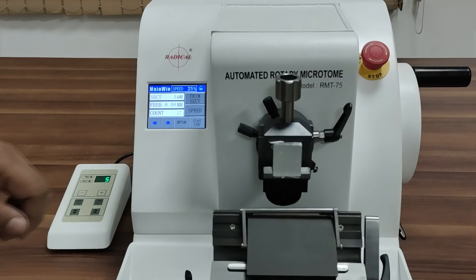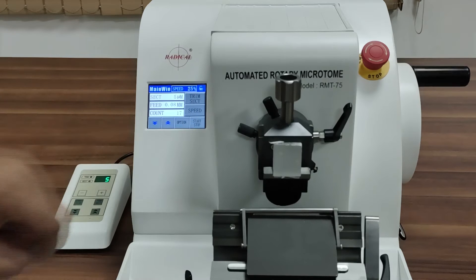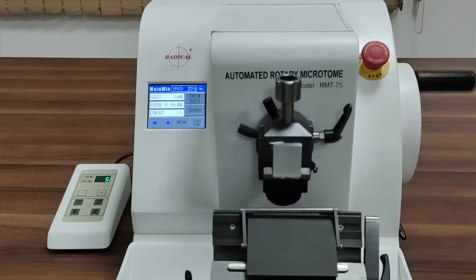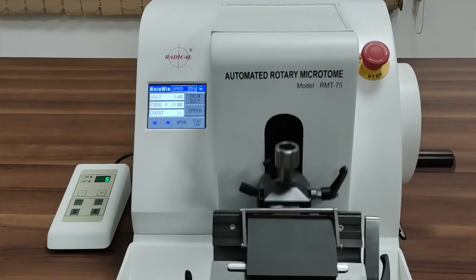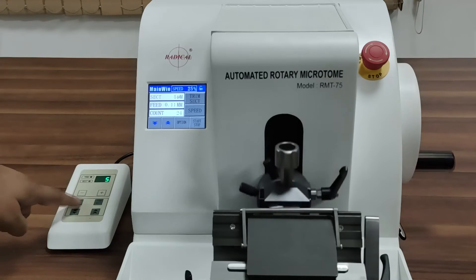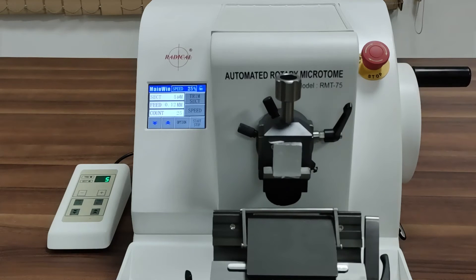The microtome features a touch screen which controls the start and stop function, displays cutting and sectioning thickness, section counter, mode and speed of stroke distance. Along with this, we also have a control panel to start and stop the microtome, which displays and adjusts the section and trimming thickness, stroke, cutting speed, and more.